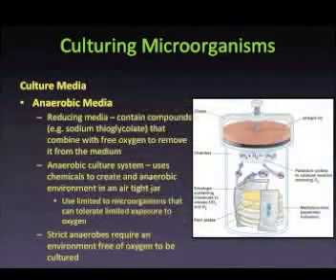When cultivating anaerobic microorganisms, the microbiologist must successfully create an anaerobic environment. One method utilized by microbiologists to create an anaerobic environment is to use a reducing media. Reducing media contains sodium thioglycolate, which is a substance that binds to oxygen and reduces it to water. The media also contains an indicator, methylene blue or resazurin, which shows the location of oxygen by changing the media either blue or pink respectively.